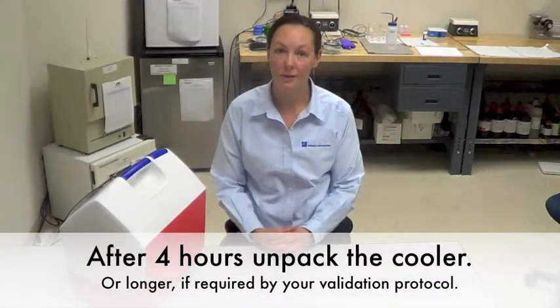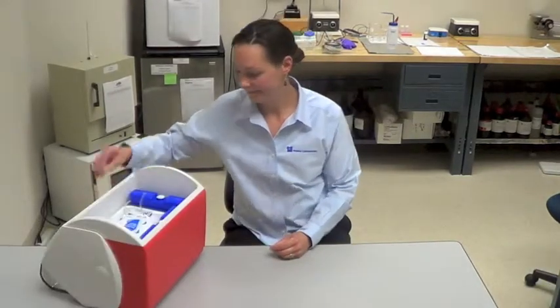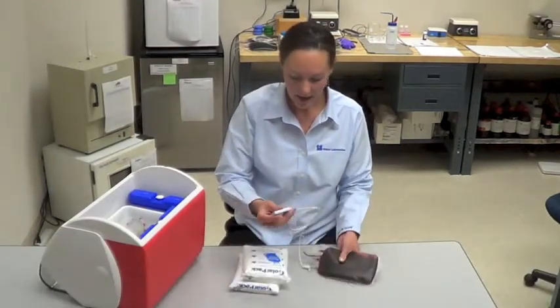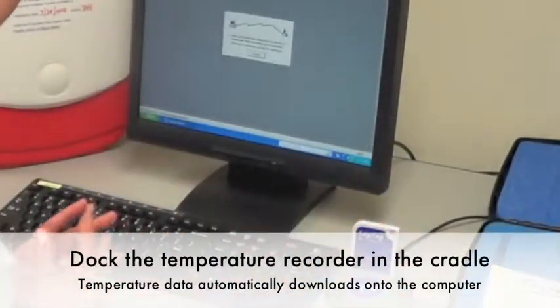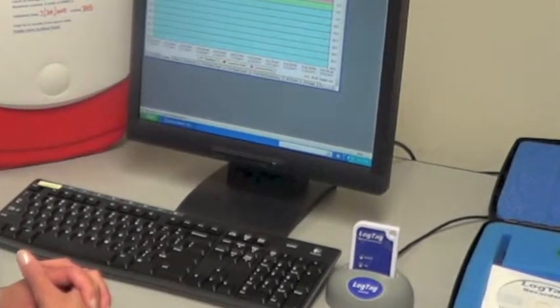After four hours, or whatever time you determine to perform your validation procedure, we're ready to unpack the cooler. Detach the temperature recorder from the probe and dock it in the cradle that's attached to your computer. You'll be able to download the temperature data onto the computer.